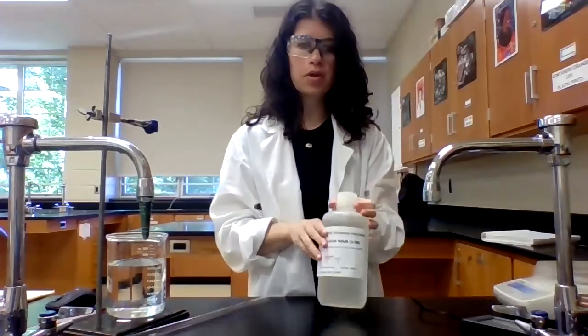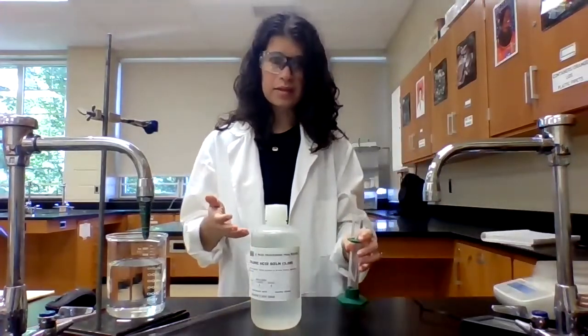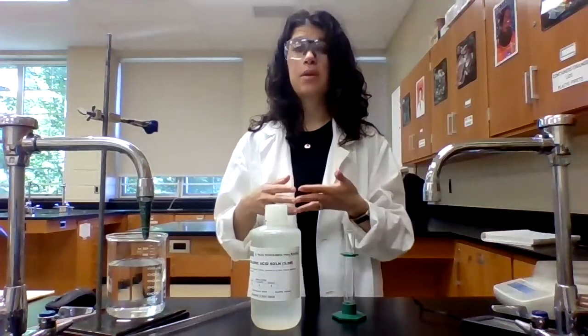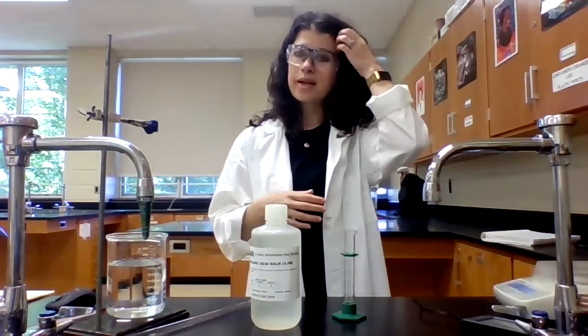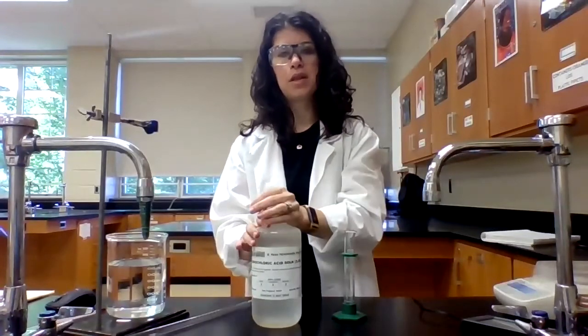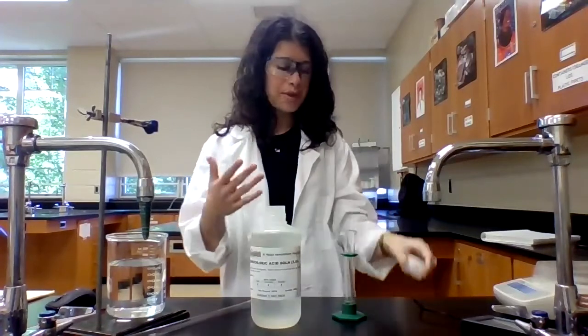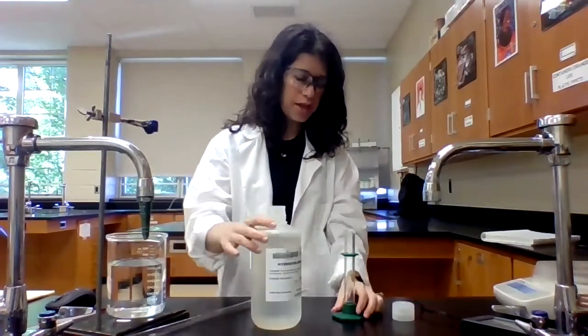I also need to measure out the hydrochloric acid that I'm going to use to react with the magnesium ribbon. We're going to be using 3 molar hydrochloric acid. The hydrochloric acid is in excess. The magnesium ribbon is our limiting reagent, so that's why we need a precise mass for the magnesium ribbon. For the hydrochloric acid, we need approximately 15 milliliters. If you're a little bit over or a little bit under, it's not a big deal because again, this is our excess reagent.